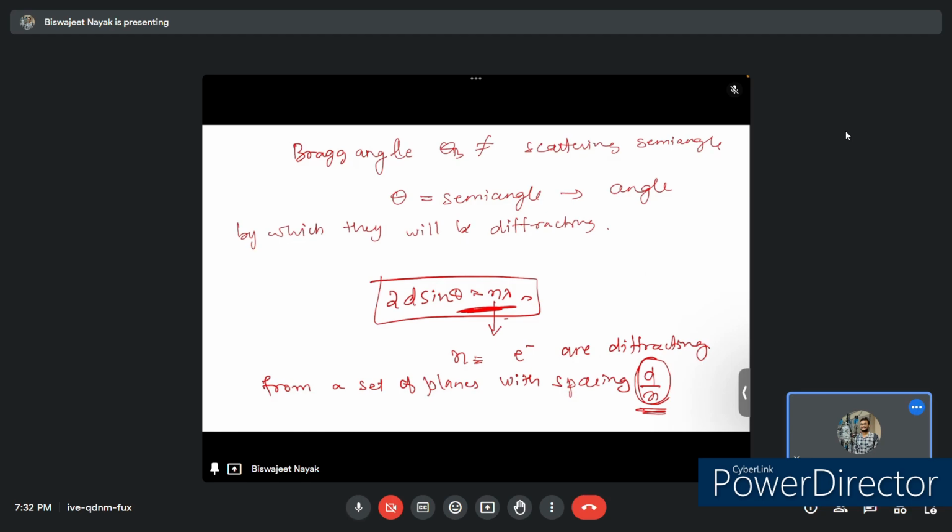So while considering this dynamical diffraction, the beam which has been strongly Bragg diffracted once is necessarily in perfect Bragg orientation to be diffracted back into the direct beam by the same set of planes.